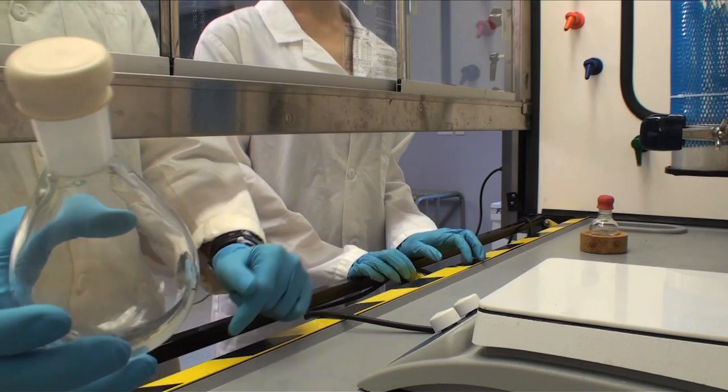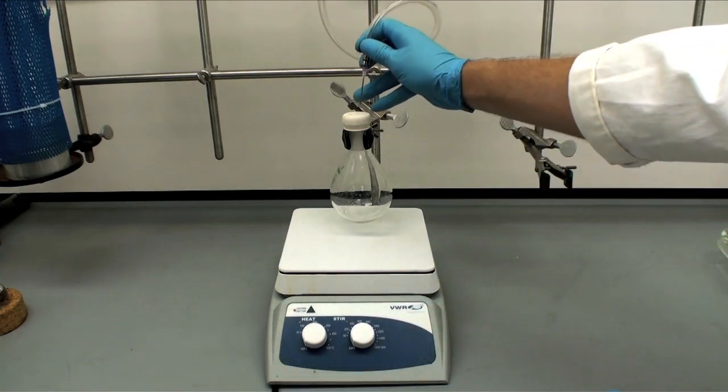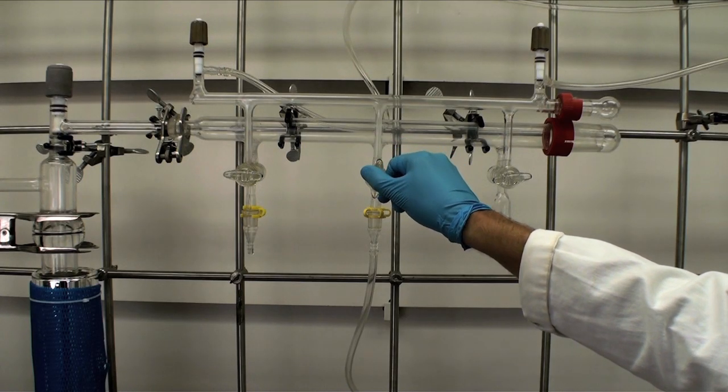First, we need to make sure that all the glassware is oven dried and then cooled in a desiccator. We now can connect the flask to the Schlenk line and evacuate the air by connecting it to the vacuum. Now we fill the flask with nitrogen.